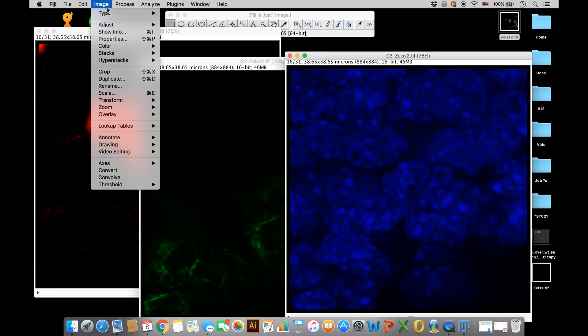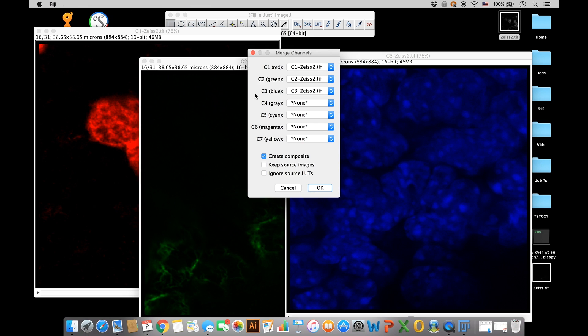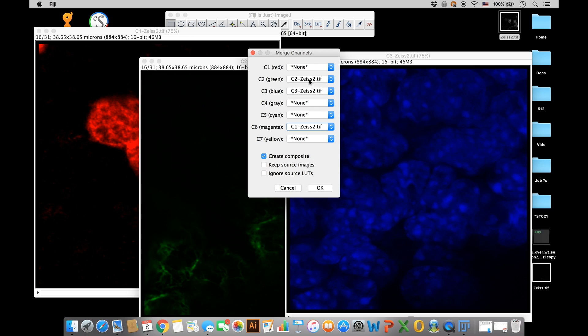You'll see all these channel options now. I'm going to take my red channel, channel 1, and throw it down into magenta. That's not all you have to do—you have to make sure that you also check this box down here, ignore source. Now after you check this box, it's going to take that red channel and throw it into magenta. Also check that keep source images button.